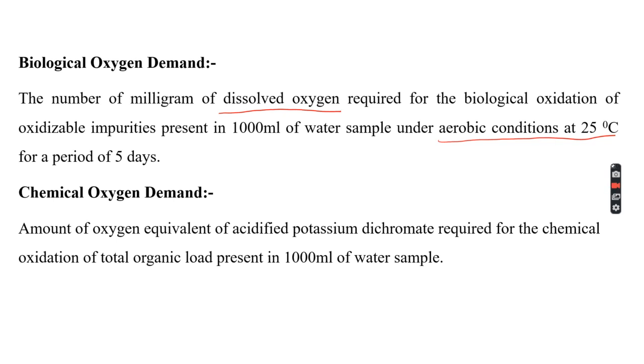That is the amount of oxygen for the biological oxidation of all the oxidizable impurities present in 1 liter or 1000 ml of water under aerobic condition at 25 degrees Celsius for a period of 5 days. And usually the BOD is expressed in terms of ppm of oxygen.